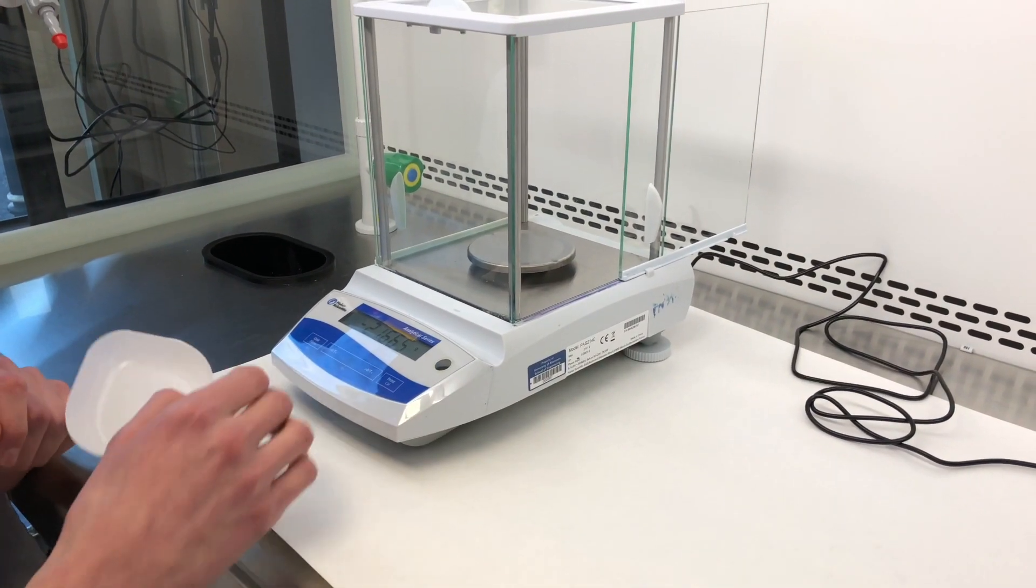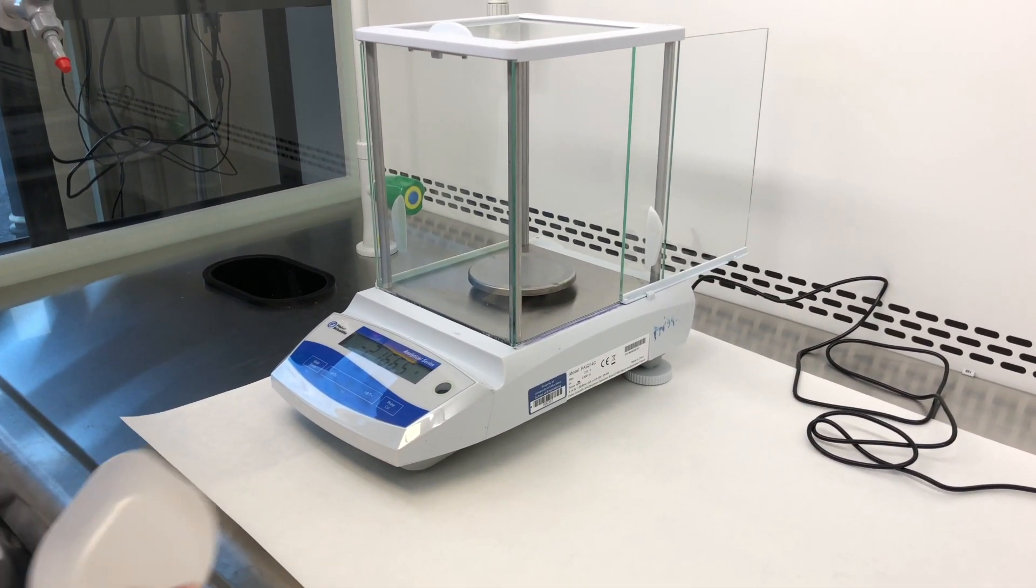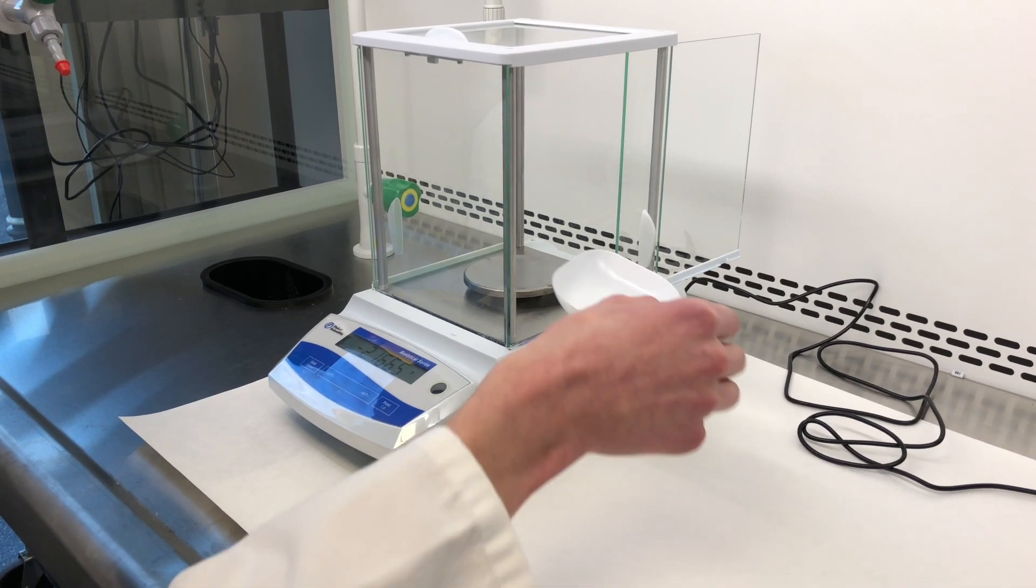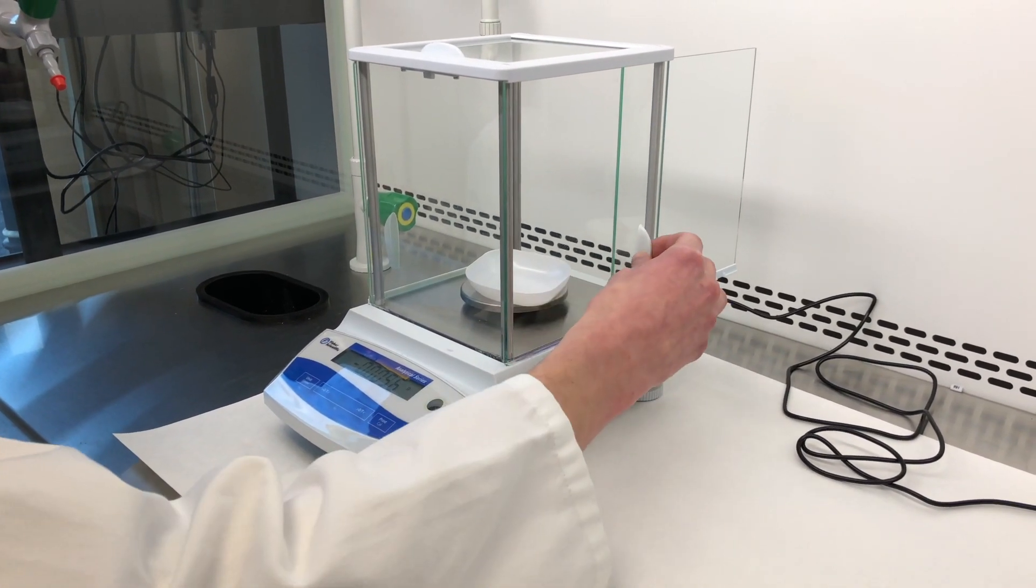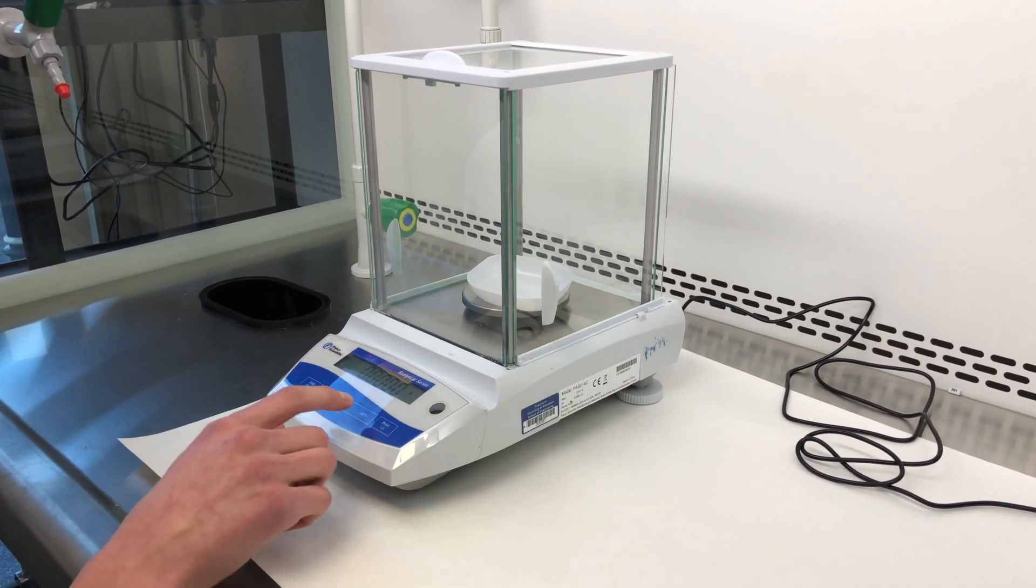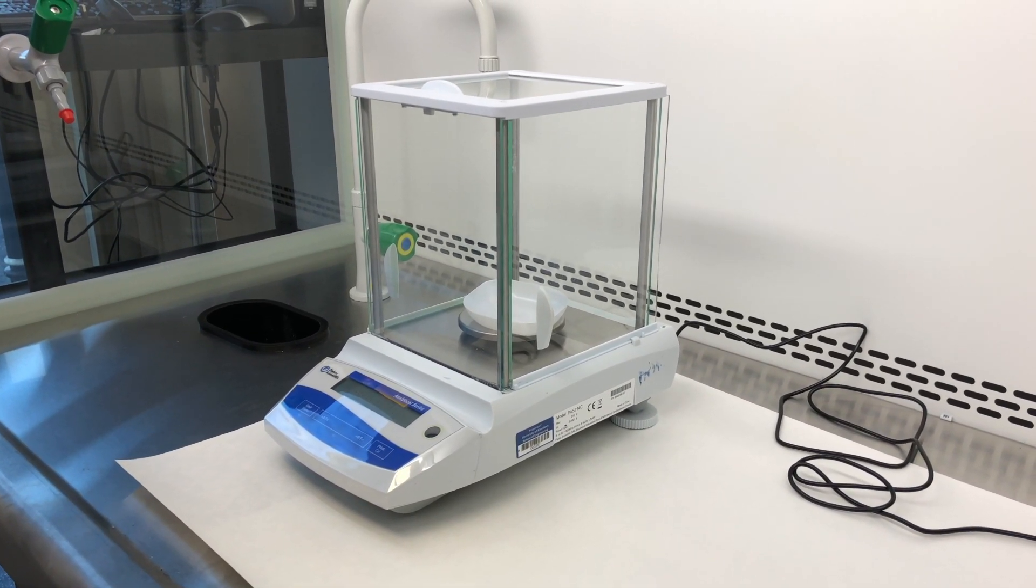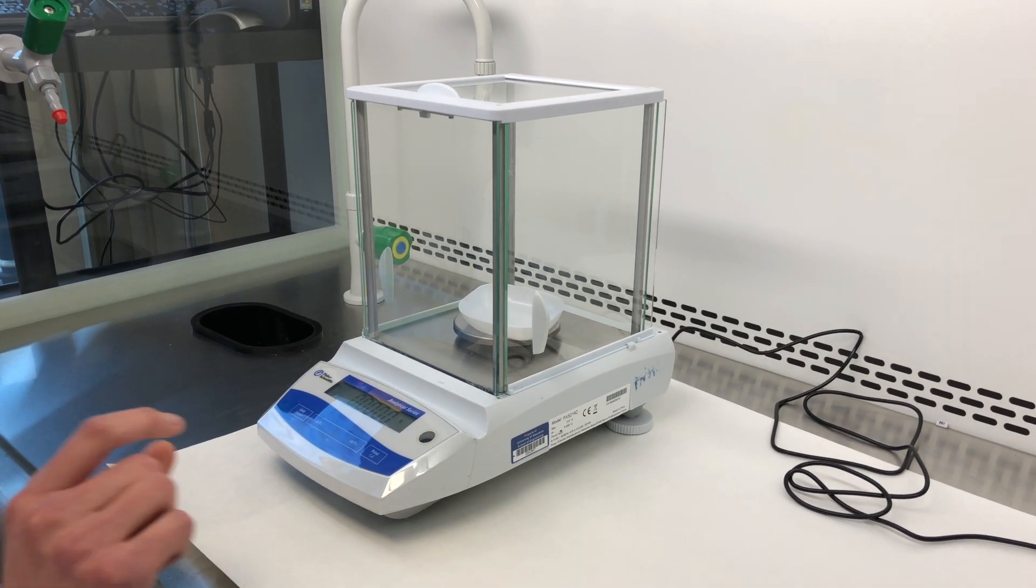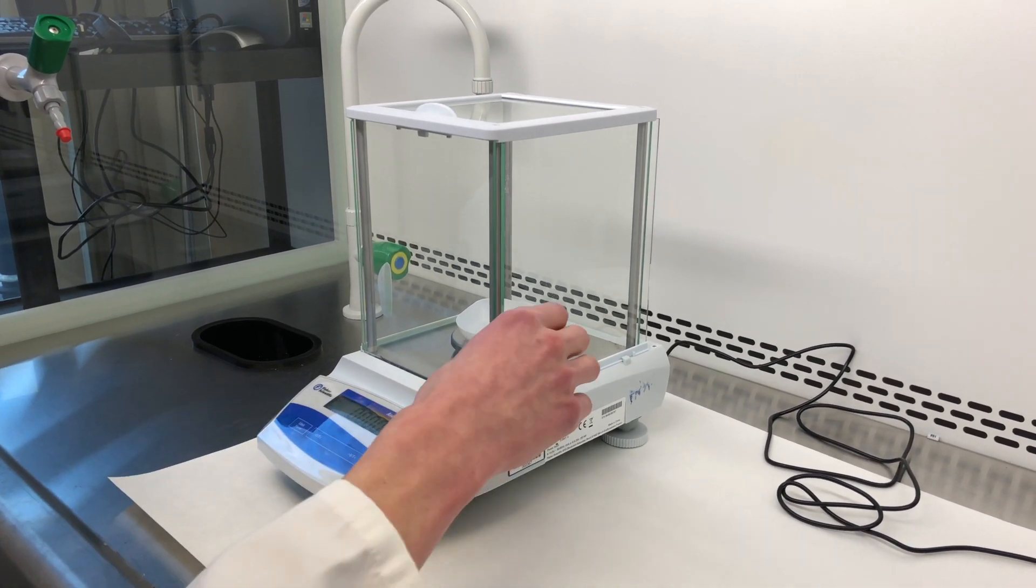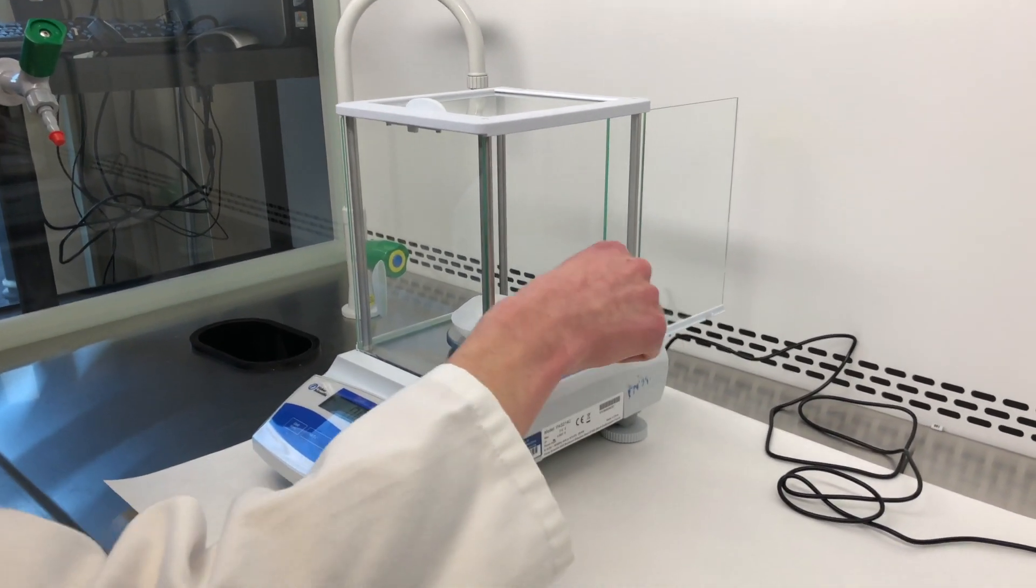So what we're doing here, we have a four decimal place weighing scale. We take an empty boat and place it on the scale, close the door, and then we zero it so that when we add the sodium hydroxide to the weighing boat, the difference doesn't include the boat itself.